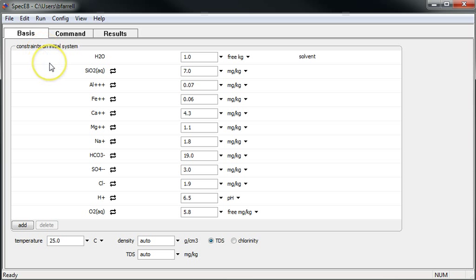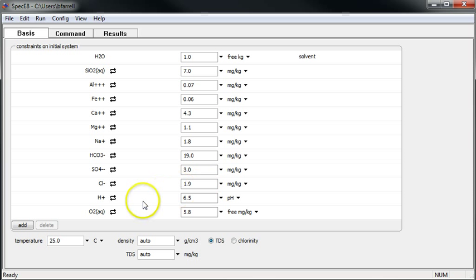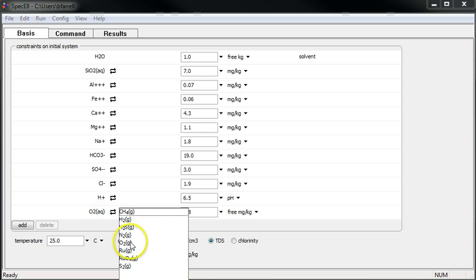I've taken a standard water analysis and used it to add a number of components to the basis pane. I specified bulk constraints or total concentrations for most of these components, except for the hydrogen and oxygen, which we have special electrodes or probes that measure pH and free oxygen concentration. If we didn't have these, we might specify equilibrium with oxygen gas, for instance.